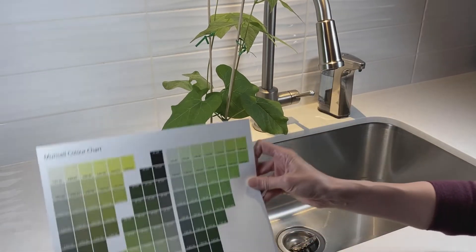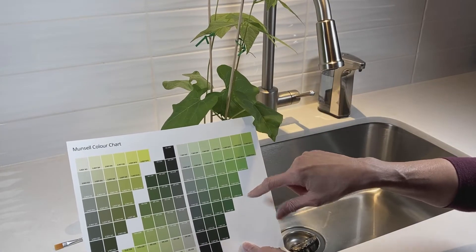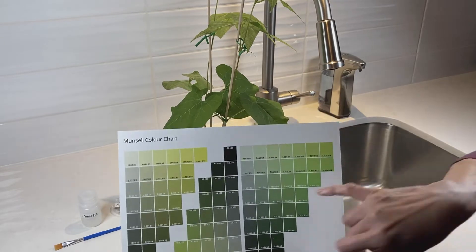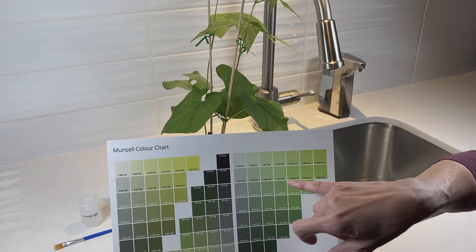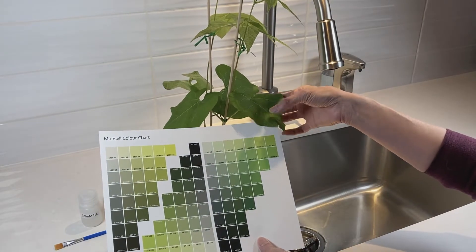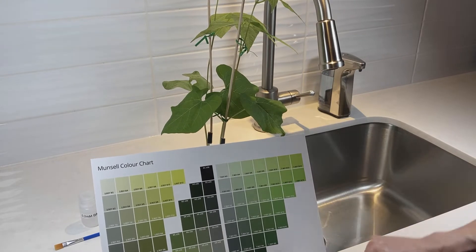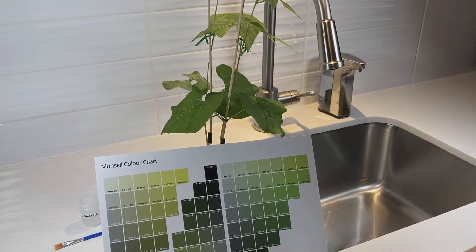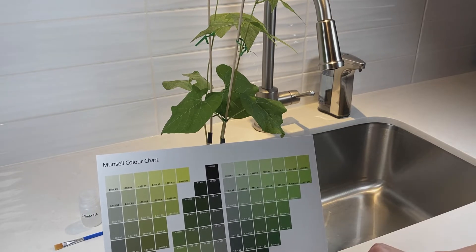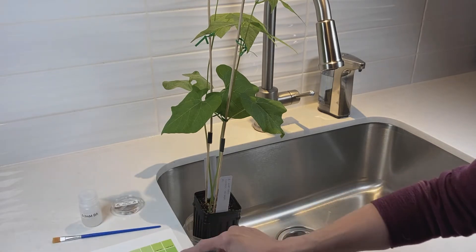So the two primary leaves, you want to match up the color to one of the color chips on the Munsell color chart. Each color chip has an identifying code for it. So once you've picked the color chip that closest matches your primary leaves, you want to note down the identifying code in your chart. These measurements should be done every other day or three times a week for a period of two weeks. And that's it for the control plant.